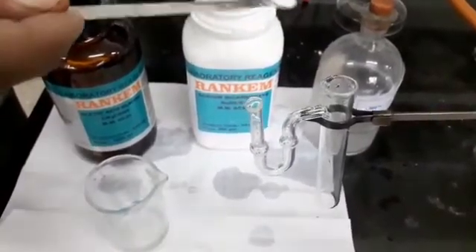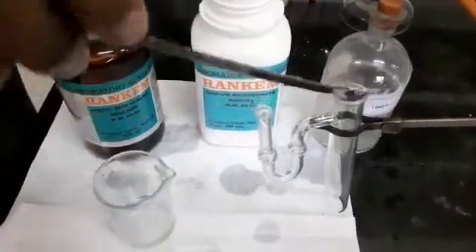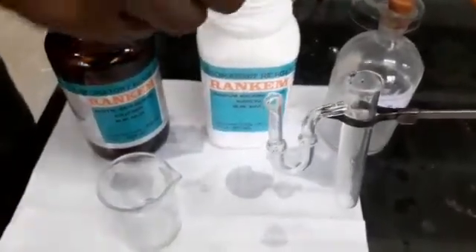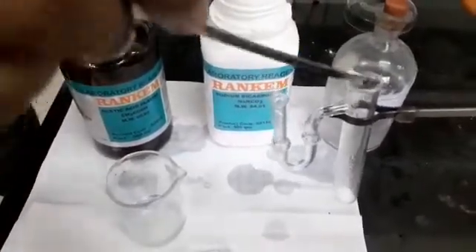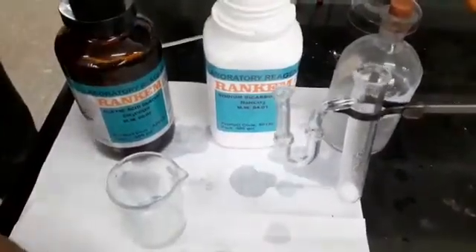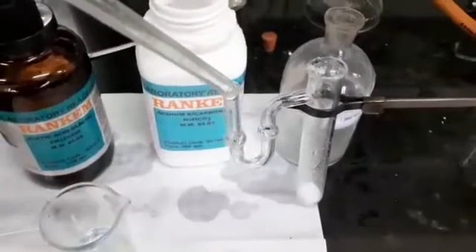For this experiment, we will add baking soda to this gas passing tube, and then add some lime water to this U-tube in advance.